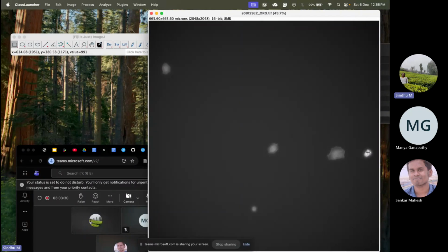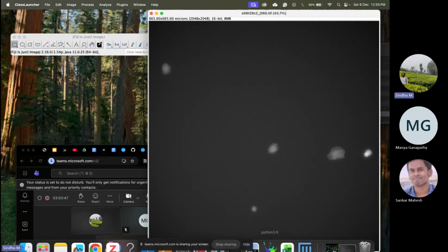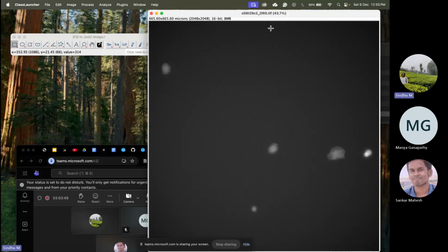In this question, they are asking, where is the 0,0 coordinate? Let's check, is it in the center? No, in the center it's around 1000, 900. If you go down, you see that the y value is increasing as you go down, which means that the y coordinate of 0 is on the top.